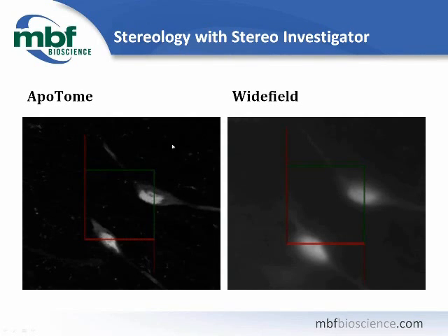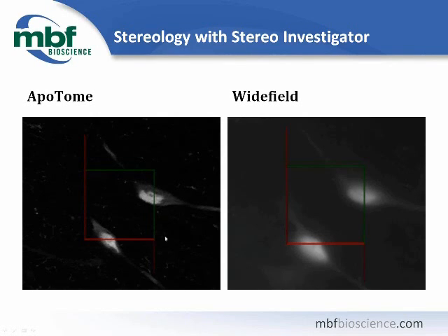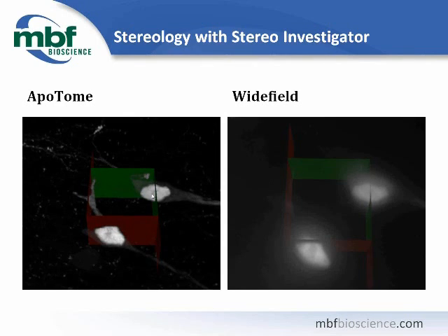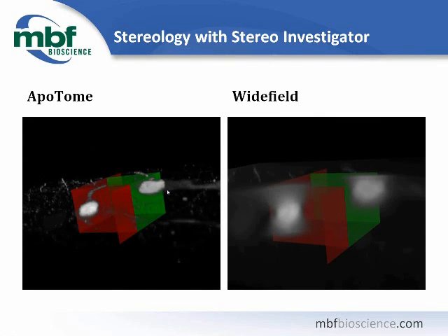If you're a Stereo Investigator user doing cell counts, we acquired an image stack in wide field mode and then with the Apatome and compared the differences. We have two cells interacting with our dissector. From top down both situations look pretty clear. When we rotate — this was done using 3D solids in the automatic counting module — by removing out-of-focus light you get rid of the haze that happens with a bright soma. Making the decision about where the cell top comes into focus within your dissector is easier using an Apatome. It's easier to identify the cell top in the Apatome image than in the wide field image where the soma casts a broad halo.